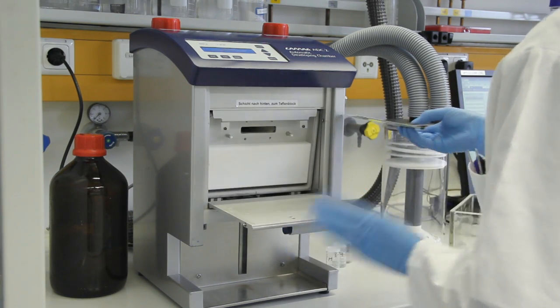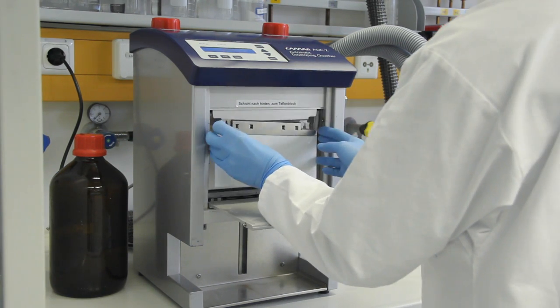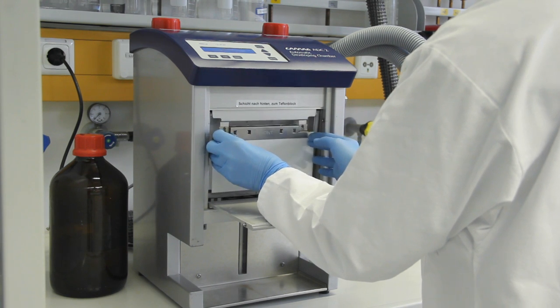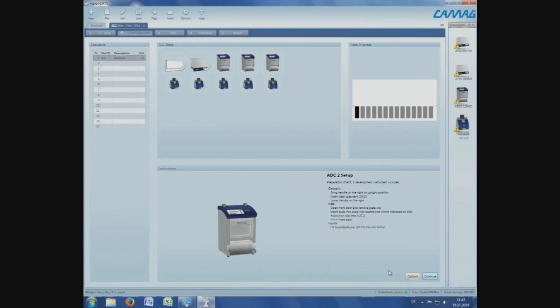Using the TLC Visualizer and the software VisionCATS, the starting zones were documented. Next, two focusing steps were performed in the Automatic Development Chamber ADC-2, guided by the software VisionCATS.